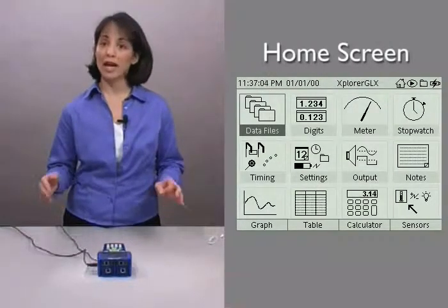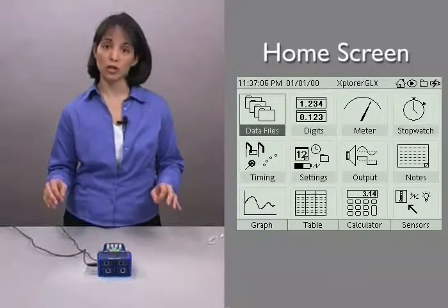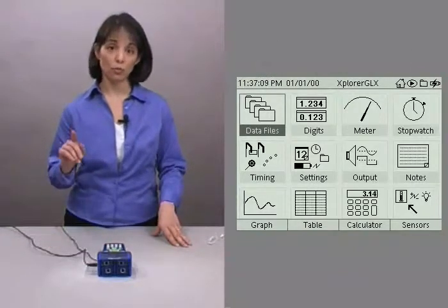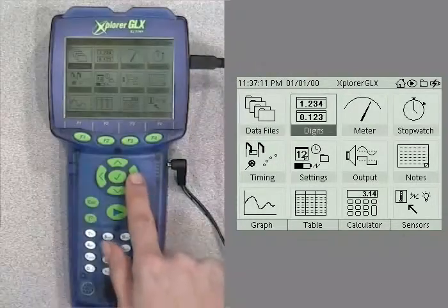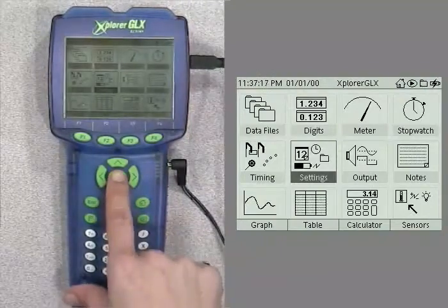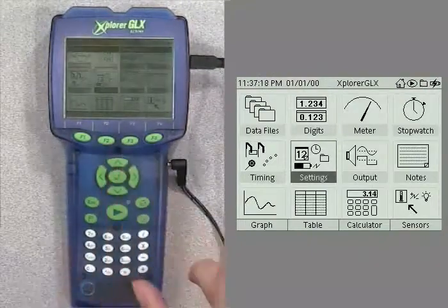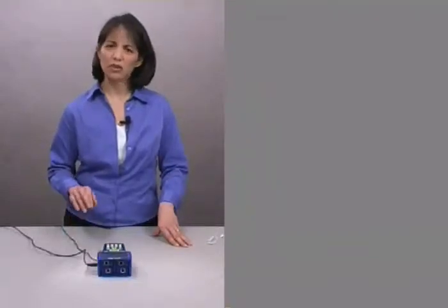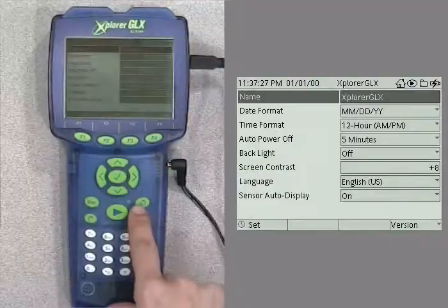From this screen you can access any of the 12 GLX screens represented by these 12 icons. To move through the icons, push the arrow keys. To open up one of the screens, push the check mark after you've selected it. Remember that at any time, even during data collection, you can get back to the home screen by pushing this home button.